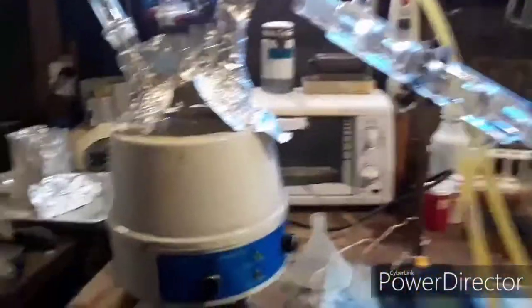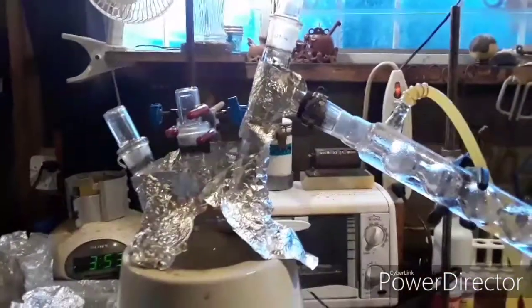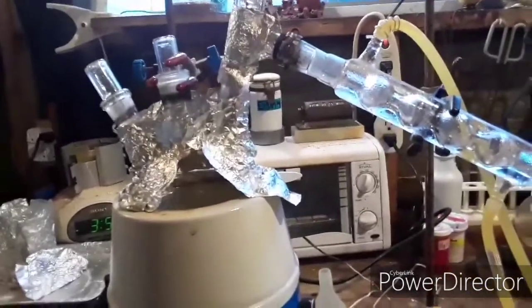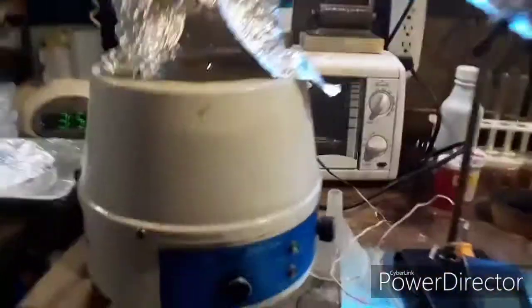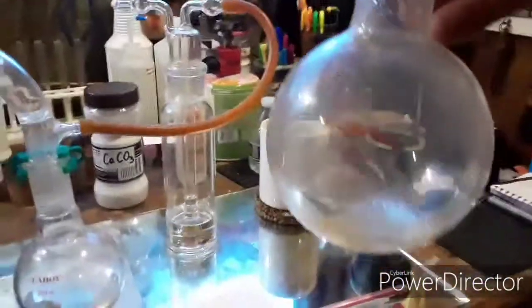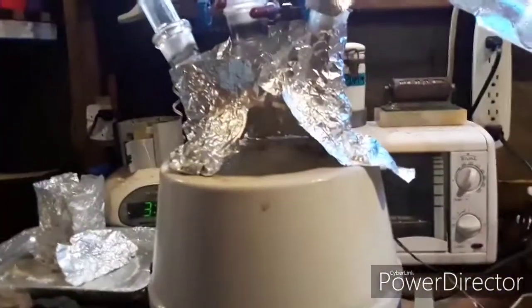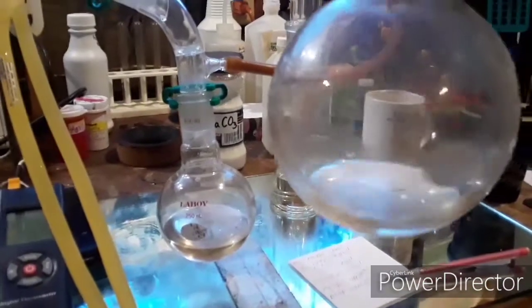I wanted to show you guys something here. What I'm doing is cleaning up sulfuric acid — I got some drain cleaner sulfuric acid and the SDS says it's between 85 and 87 percent. I charged my reaction flask with it and ended up distilling off water. This is 500 milliliters and I got probably close to 100 milliliters of water that came over.